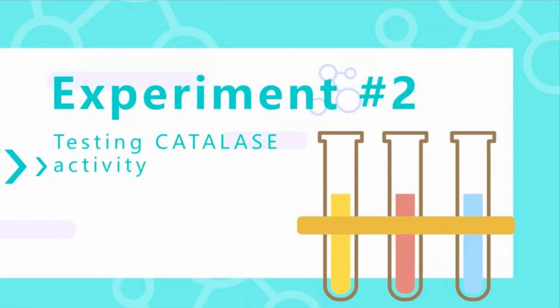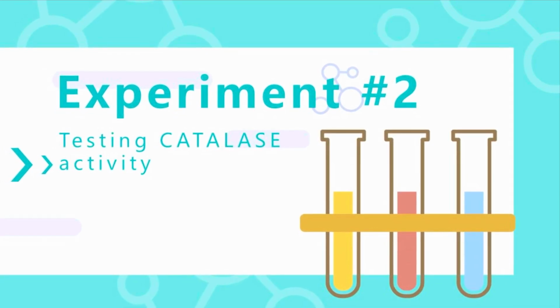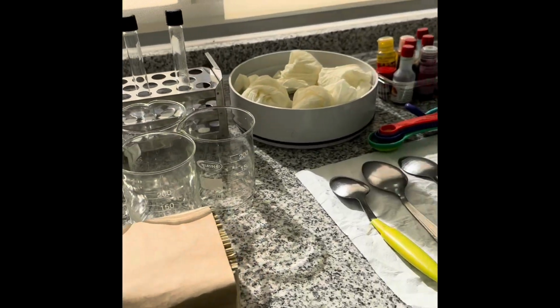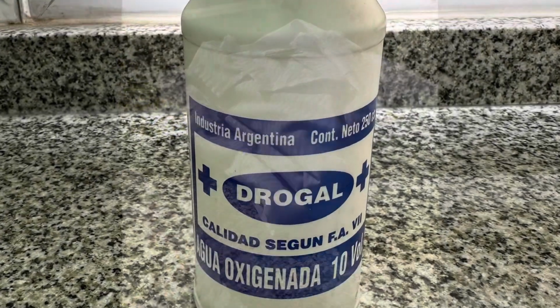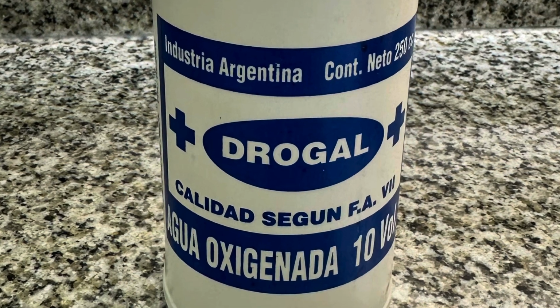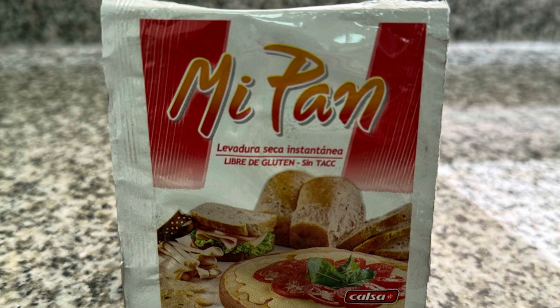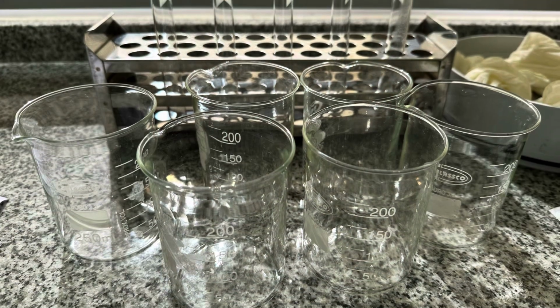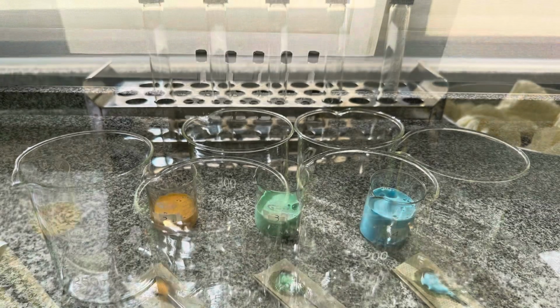Experiment number 2. Testing catalase activity. In this experiment, we will simulate the function of catalase enzymes in the body, and how the amount of substrate or product might affect the rate of reaction or the amount of product released. We will use hydrogen peroxide and yeast, which contains catalase, to experiment with samples containing different concentrations of hydrogen peroxide. As the hydrogen peroxide reacts with the catalase, it breaks down into oxygen and water, and we will observe the release of oxygen as bubbles or foam.